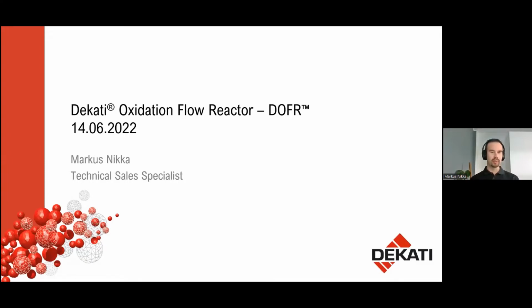So today we will talk about our new product for secondary aerosol measurement, the Dekati Oxidation Flow Reactor. The webinar is recorded and will be available later on our YouTube channel. If you have questions during the presentation, please write them to the chat box where everybody can see them, or to the Q&A box where I'm the only one who can see them and I can answer your question privately if you prefer.